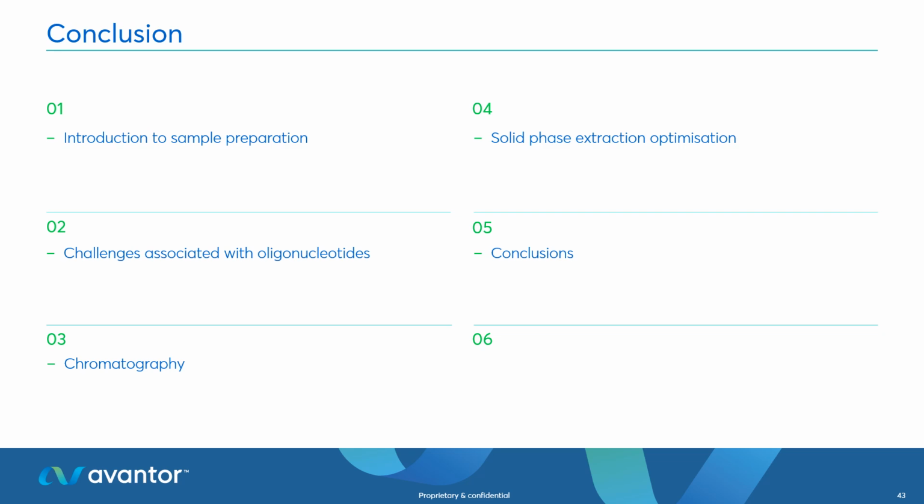But in this case, because of the complexity, as I hinted at during the oligonucleotide description, it just really wasn't applicable. We actually had to use ion pairing reagents in order to drive the oligonucleotide off of the cartridge. But yes, we did have a look at different approaches. So I've kind of shortcut a lot of the method development. And even then, there was still a lot to go through. But yeah, good question. Thank you.